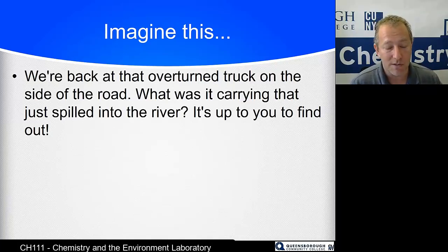The new way, of course, of doing these things for the vast majority of the time is you get a small sample of the stuff and you inject it into a gas chromatograph mass spectrometer and the computer spits out what it is. But there are times when you certainly can't do that. Aqueous solutions don't play with mass specs particularly well, for example. And so here we are.